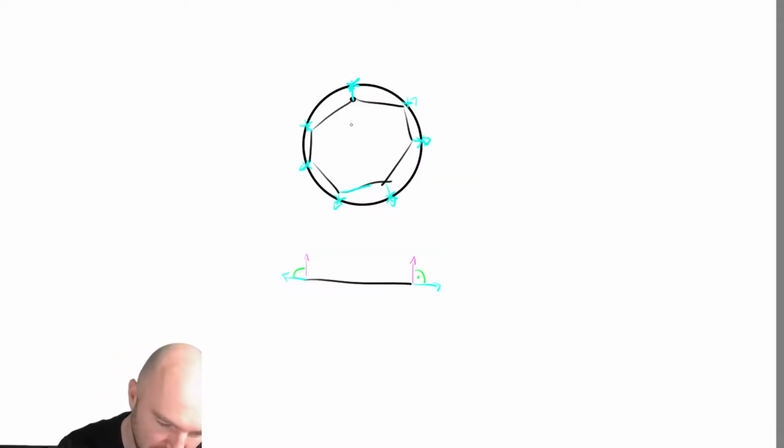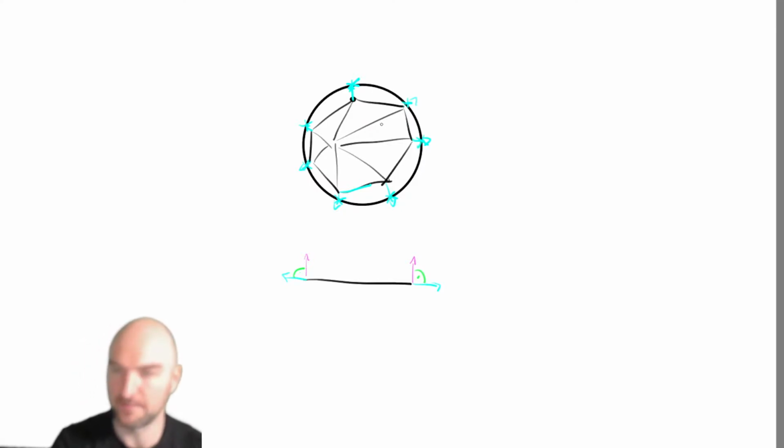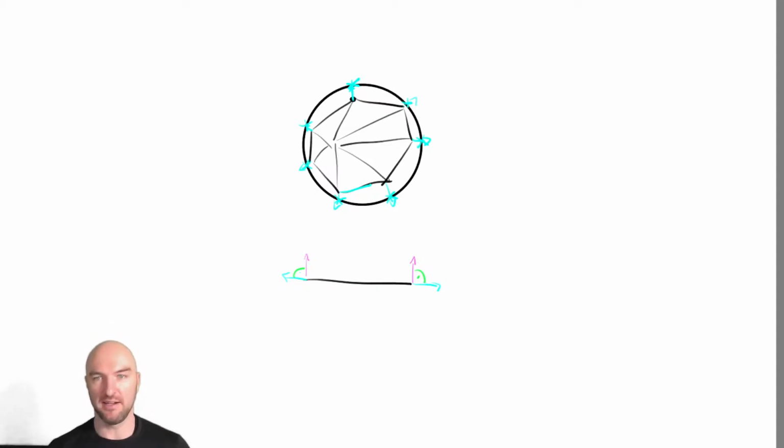Obviously, the finer details are what happens with the triangles and so on and so forth, but I do not have to bother you with that. All you have to understand is that that's actually a fairly simple algorithm.